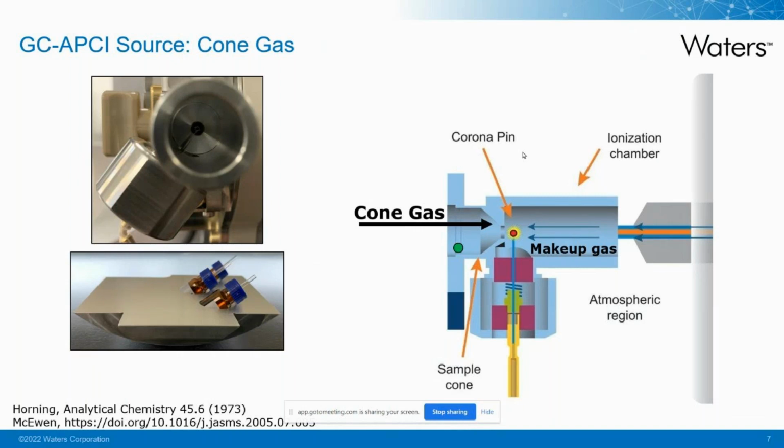Note that this whole region outside the blue ionization chamber is at atmosphere. So doing this switchover doesn't require venting the system, whether you're going in to do standard maintenance or to just add water into the source, as is shown in the right-hand side. So the right-hand side shows the way we introduce water as a reagent when we want to encourage protonation. We'll talk about ionization next.